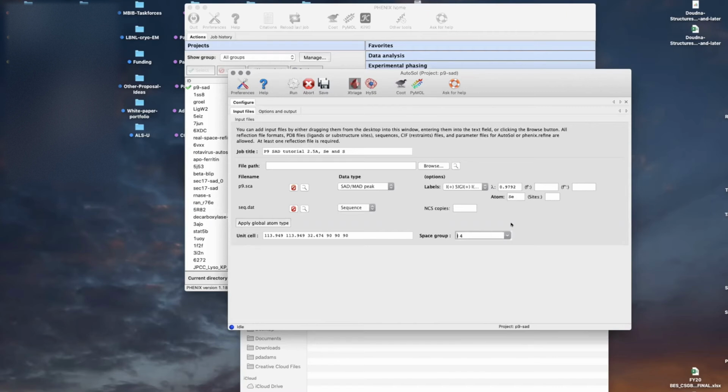And the space group, one more thing about it is this program is going to look at that space group, and if it has an inverse, it will look at the inverse of that space group. If there are some other possibilities for this space group which you have not yet eliminated, you might need to run the program more than once. So for this particular case, we only needed to run it once. But if our space group was, for example, maybe P6, maybe P6 sub 1, maybe P6 sub 2, etc., because we collected it in P6, but we didn't measure any reflections along 00L, so we have no idea which one of those screw axes is present, we'd have to run it 4 times.